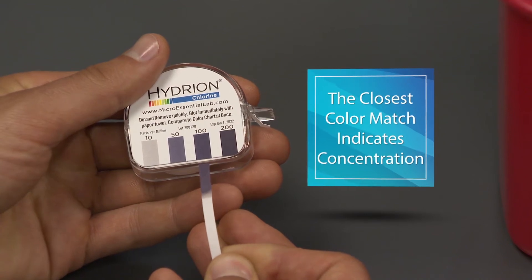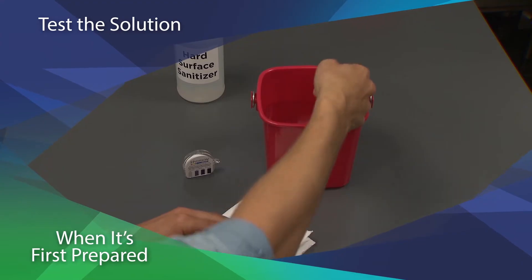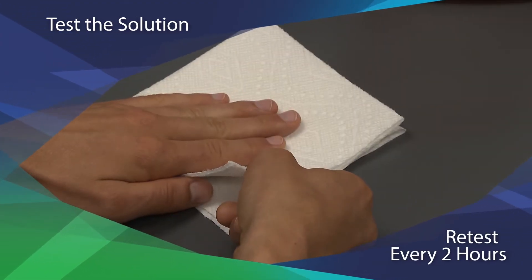The closest matching color indicates the free chlorine concentration. Test the solution when it's first prepared and retest it every 2 hours or so.